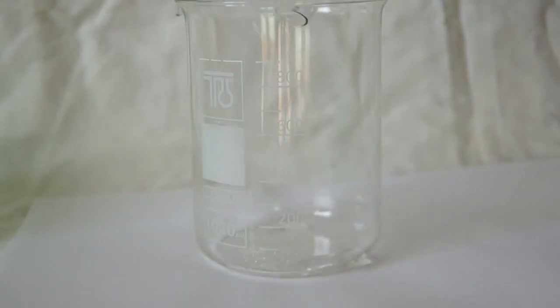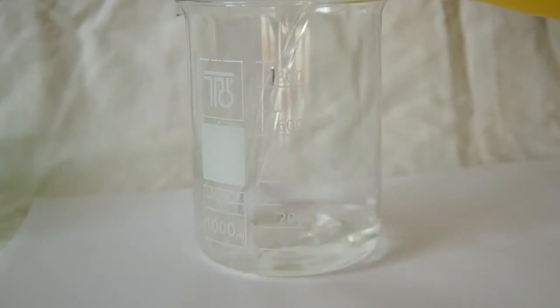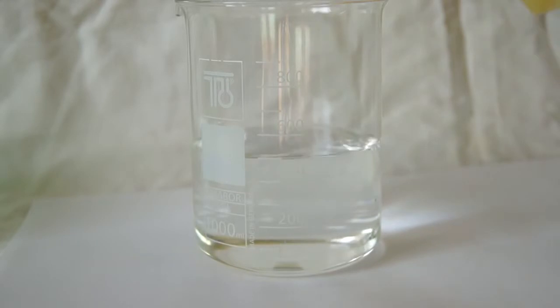Next, let's take another beaker and add there about 5 milliliters of 30% hydrogen peroxide, and dilute the entire volume of the solution to half a liter. And here we have prepared both solutions.